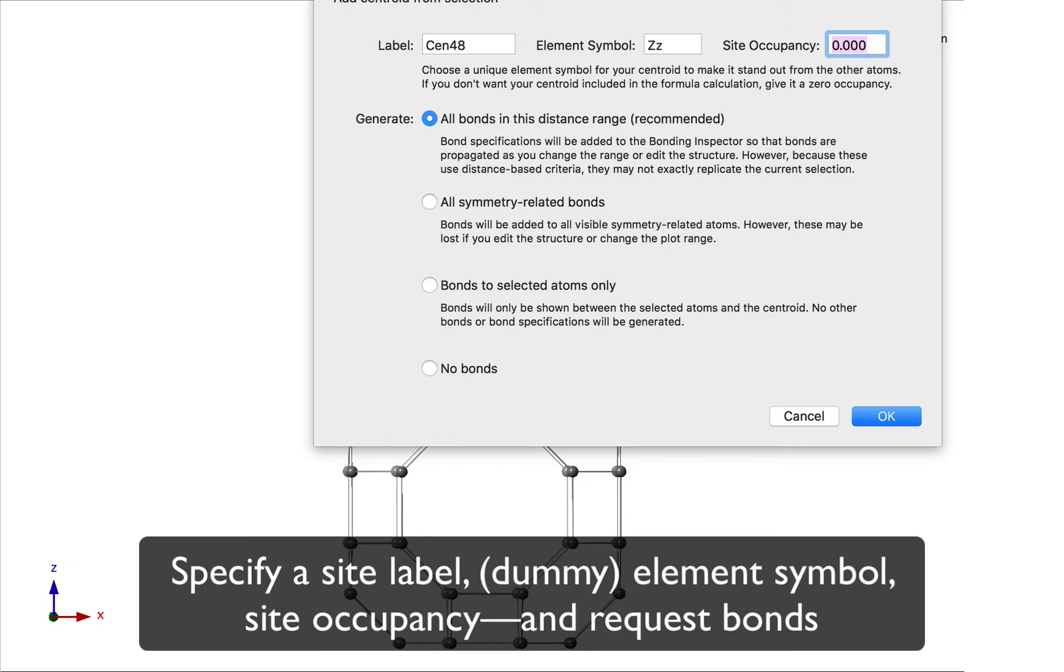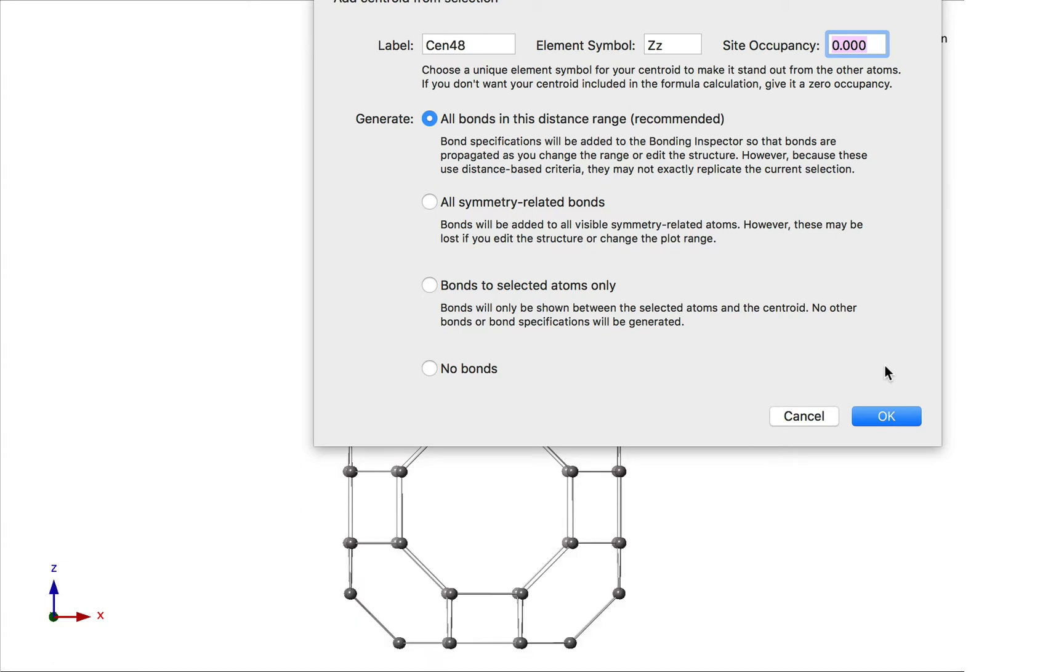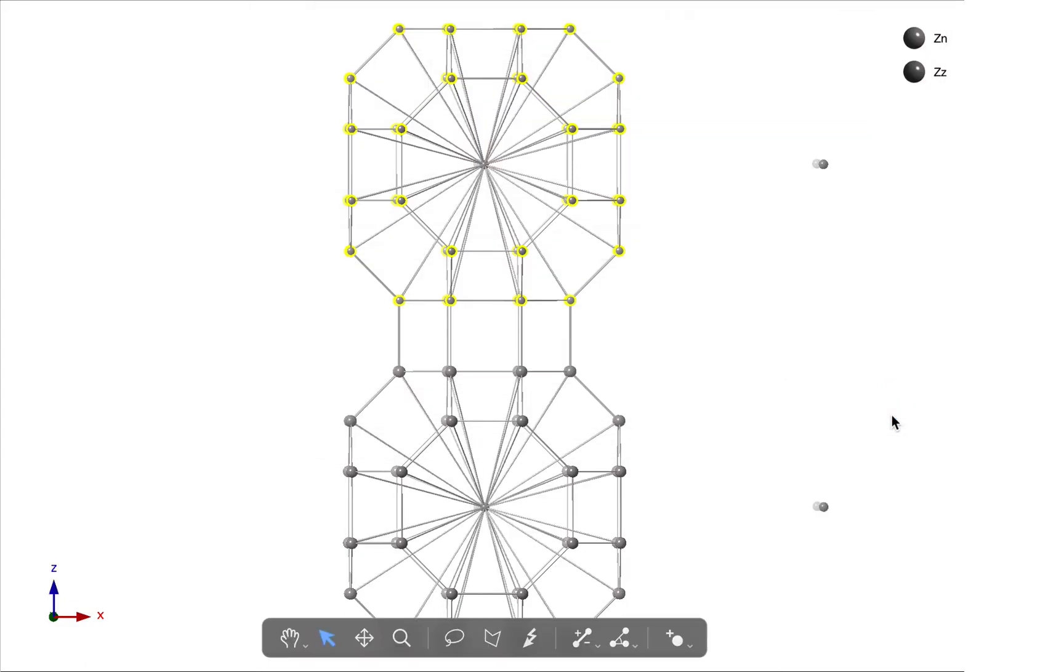Notice that by default, CrystalMaker is giving you a site occupancy of zero. This means that the calculated formula for the resulting structure won't include the dummy atoms. Now we're going to use the default option, which is to generate all bonds in the distance range. Those are bonds between our dummy atom and the vertex atoms. These bonds are essential because polyhedra require bonds between a centroid atom and vertex atoms. So let's just click OK.